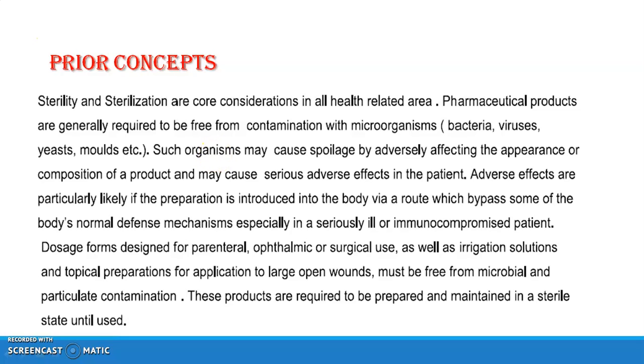First we'll see the prior concept. Sterility and sterilization are a core consideration in all health-related areas. Pharmaceutical products are generally required to be free from contamination with microorganisms like bacteria, viruses, yeast, molds, etc. Such organisms may cause spoilage by adversely affecting the appearance or composition of the product and may cause serious adverse effects in the patient. Adverse effects are particularly likely if the preparation is introduced into the body via a route which bypasses some of the body's normal defense mechanisms, especially in seriously ill or immunocompromised patients.